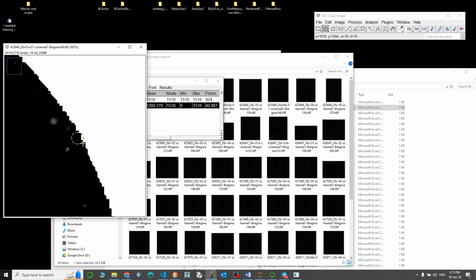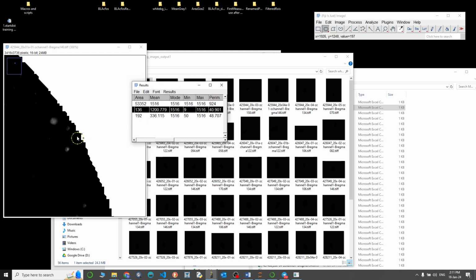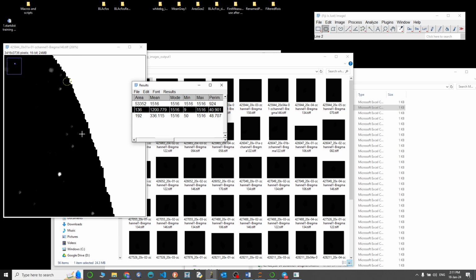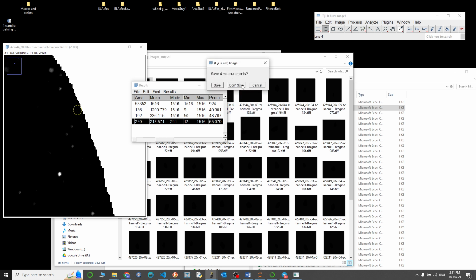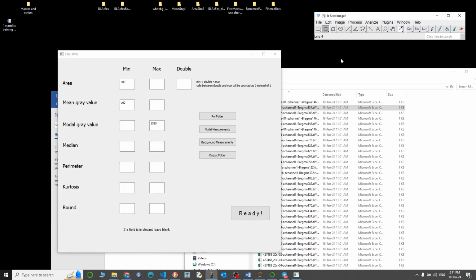The problem is that with black backgrounds, many times you have something like that, which might give you a mode of 1516, which is the case, but maybe not if this whole thing is actually the same pixel. It's not here, you cannot see it, but it's different pixels. And I think sometimes you even have predictions that are completely or almost completely inside, and then you get a different mode and you cannot get rid of it anymore. So that's the idea, and that's the reason we're doing it as we're doing it.